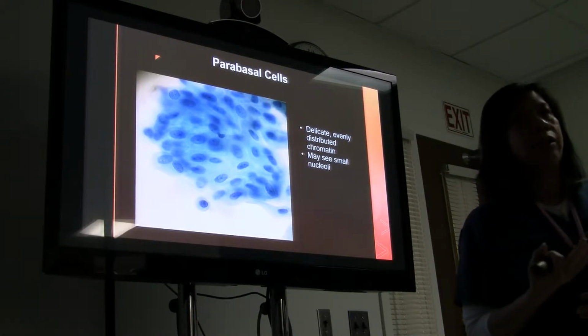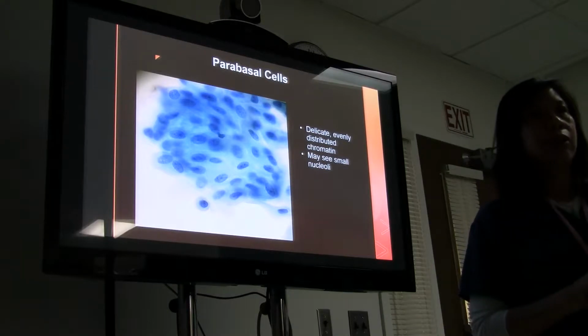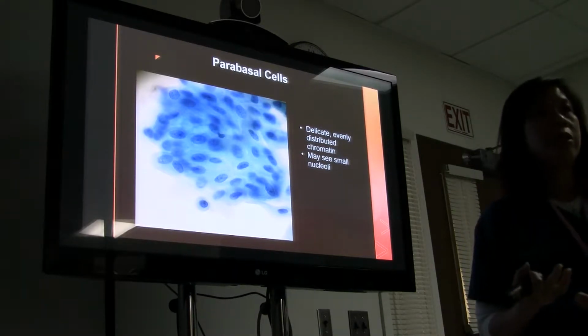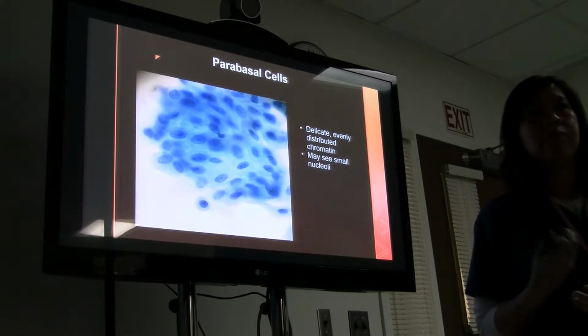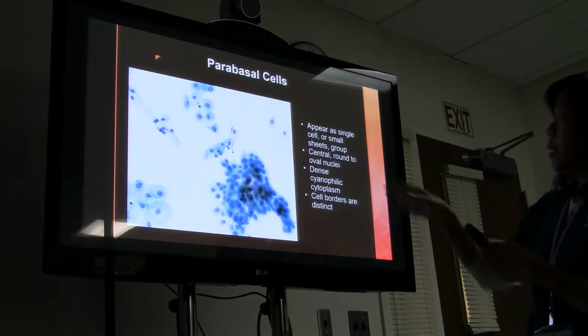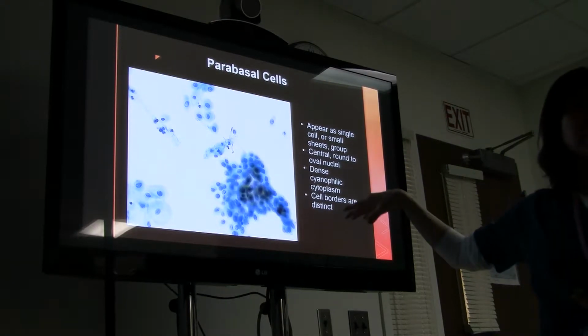So later on in your quiz, if I ask you to describe the morphology of a squamous cell, parabasal type, you would need to be able to tell me all of this, okay?